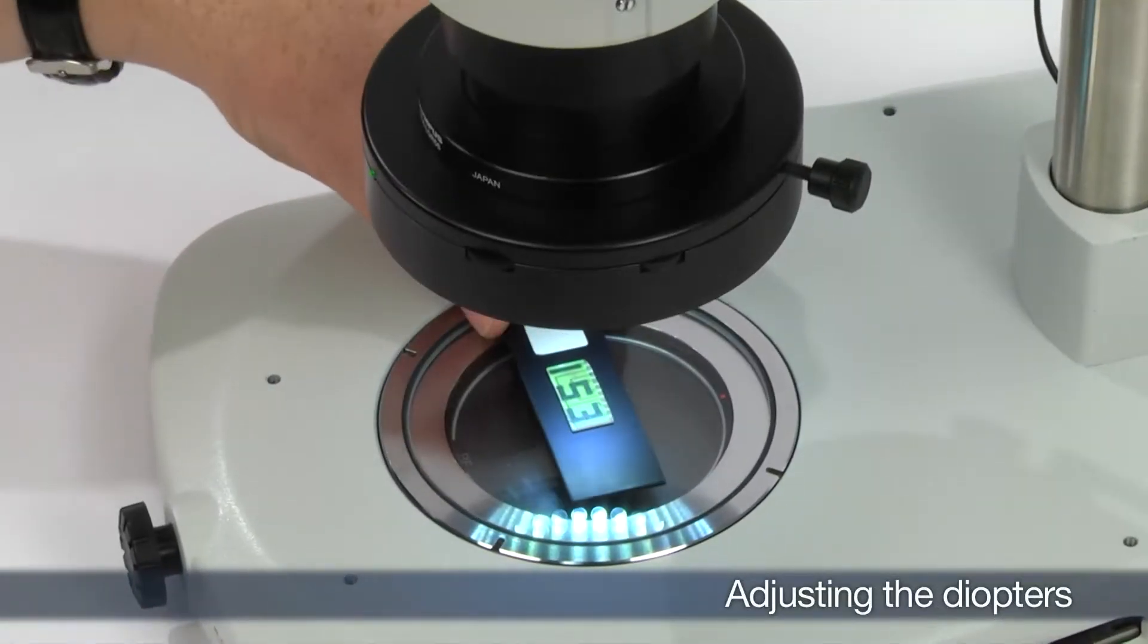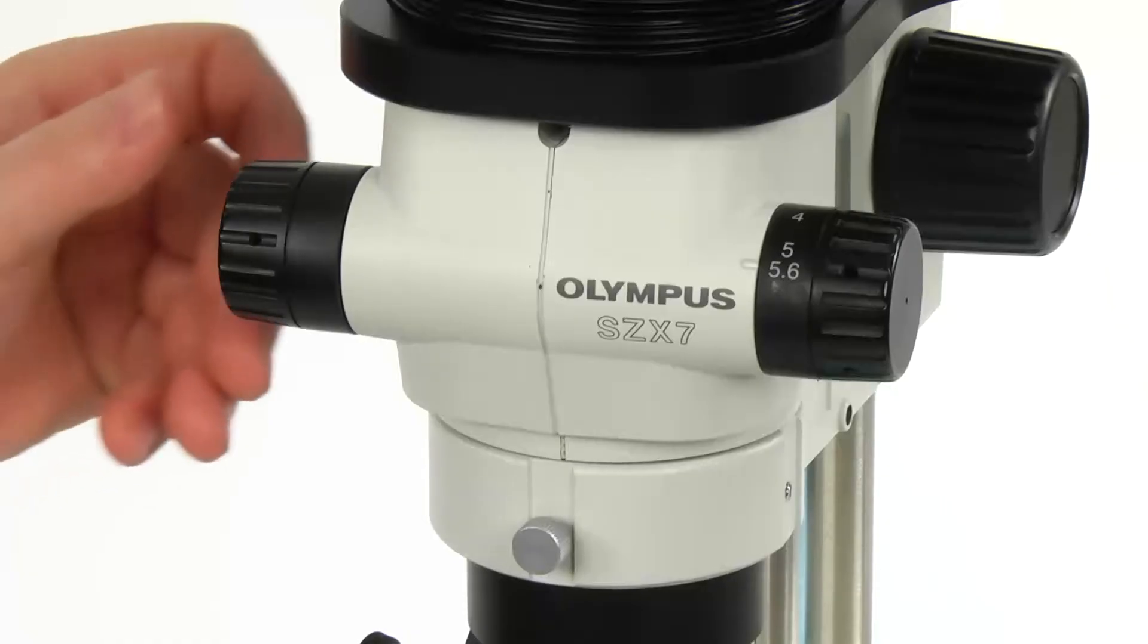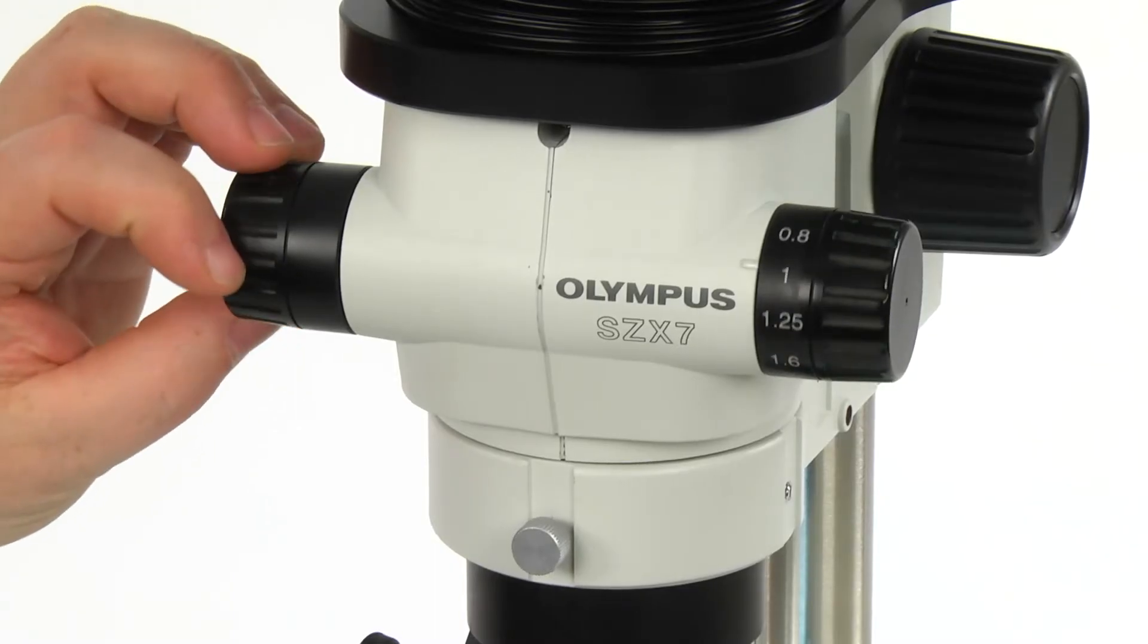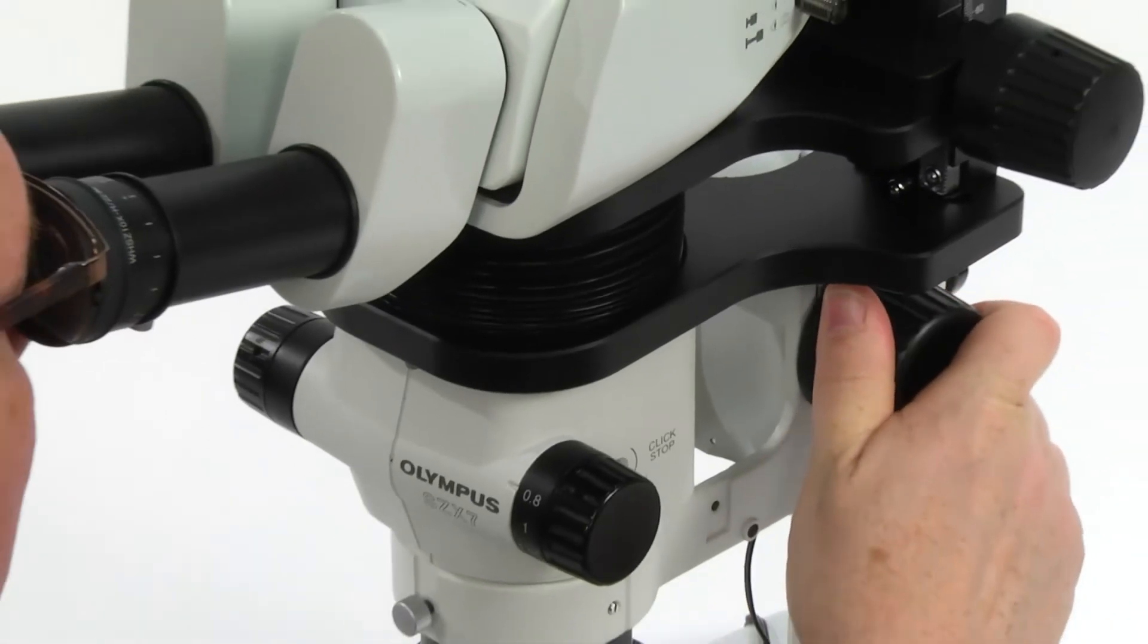First, place a simple large sample that will be easy to observe on the stage plate. Set the zoom adjustment knob for the lowest magnification and rotate the focus adjustment knob to bring the sample into focus.